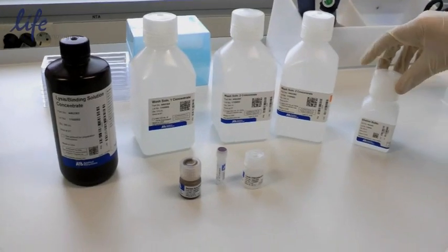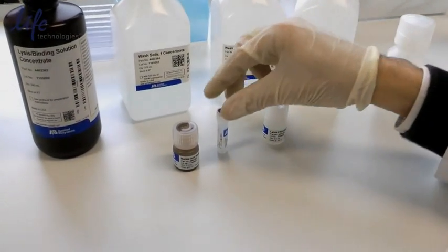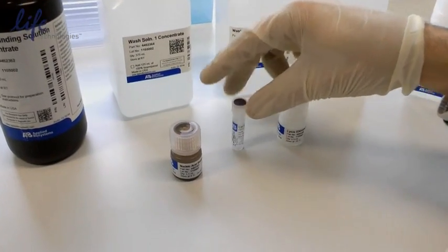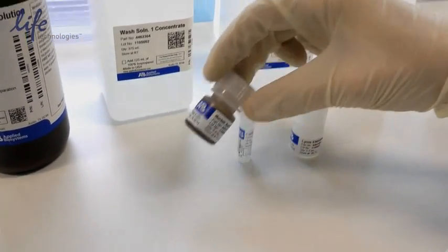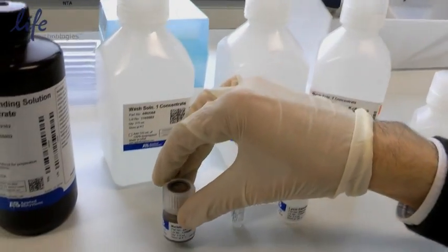The smaller ones over here are the lysis enhancer, the carrier RNA, and nucleic acid beads. These are the beads that are going to be doing the separation.